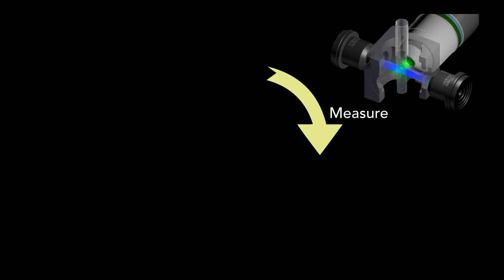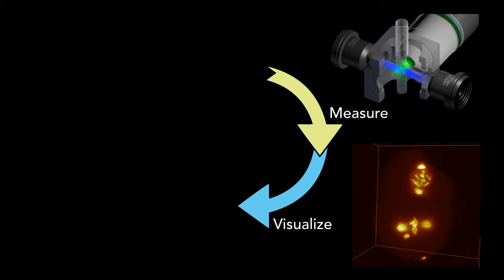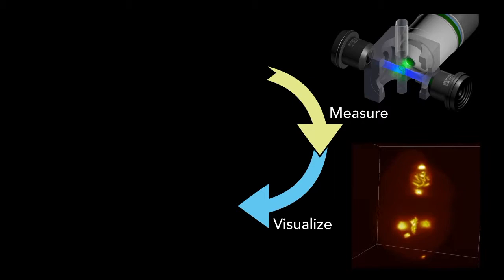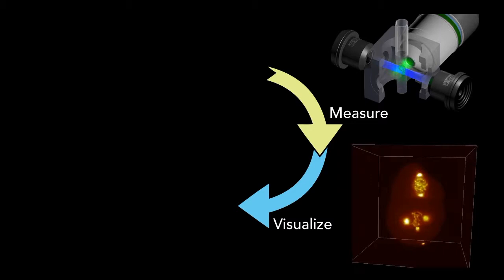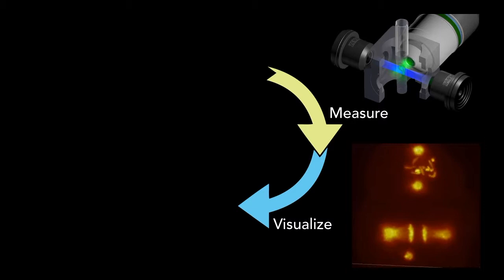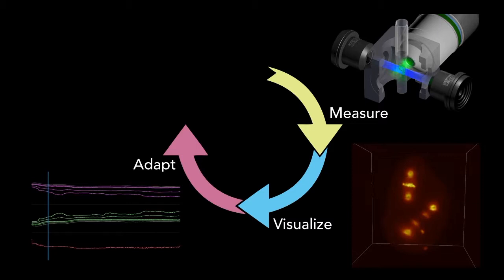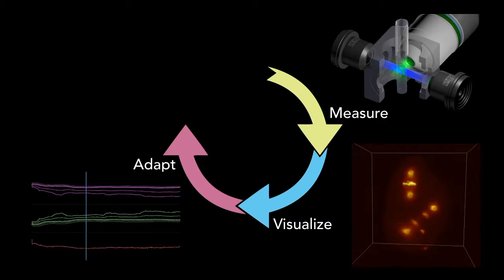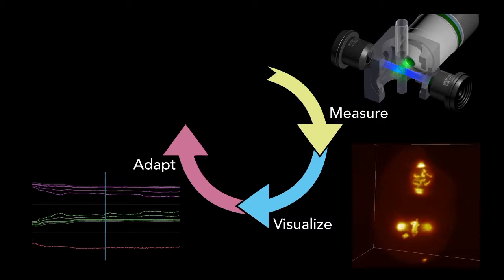Once you have a machine that can measure, that's great, but then ideally you want to visualize that, and in the ideal case, you want to visualize it in real time so that you can see instantly in 3D and rotate a sample on the screen. We actually can do that with the latest technology we have developed. If you can do this visualization in real time, it also means you can process the image data in real time and do all sorts of things with that. That affords you a unique opportunity, which is to adapt the microscope in real time so that we can push the resolution of these systems to the limit. So now the microscope is not just a static machine that will take images. It's an adaptive system that tracks and adjusts itself automatically to the sample.